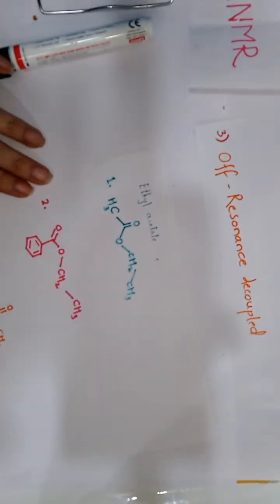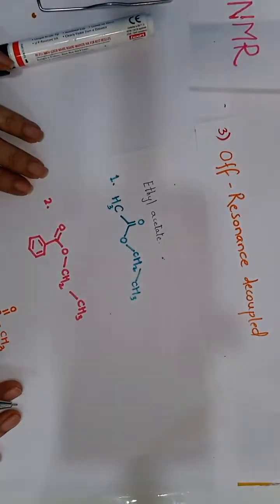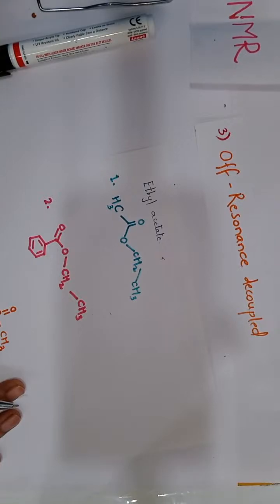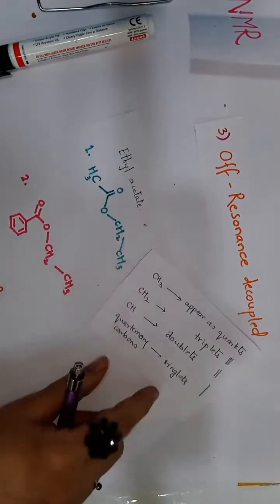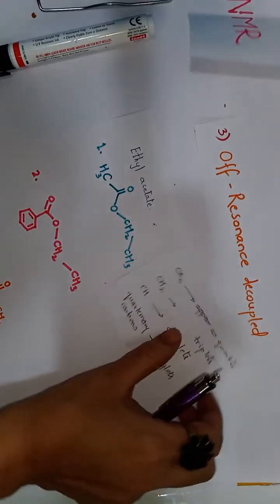Now how do we interpret this off resonance spectra? Let us see. As I told, CH3 will appear as a quartet.